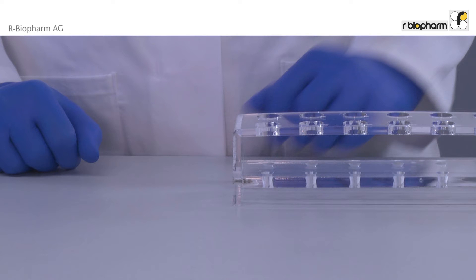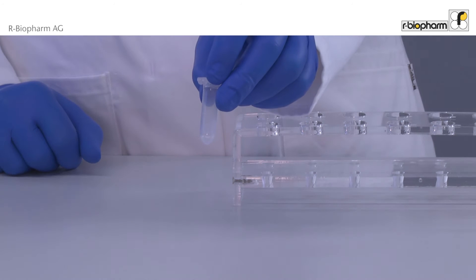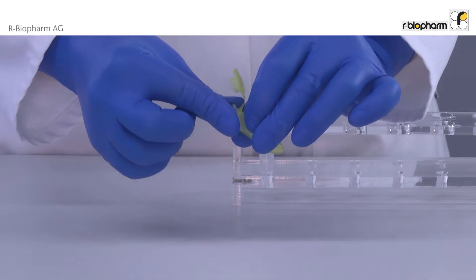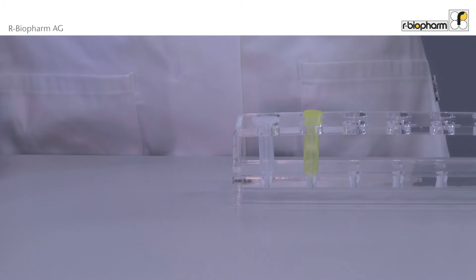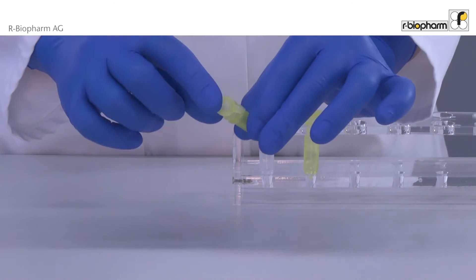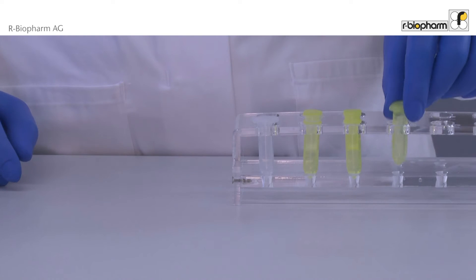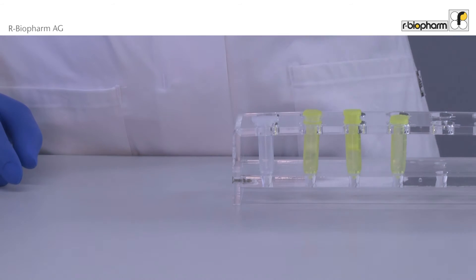While the sample is incubated, the tubes and filters are arranged for the next steps. Take a clear reaction tube, which is not supplied with the kit. The clear spin filter is placed into a yellow receiver tube. A yellow spin filter is placed into a yellow receiver tube. Next, take only a yellow receiver tube. Finally, use a clear reaction tube.